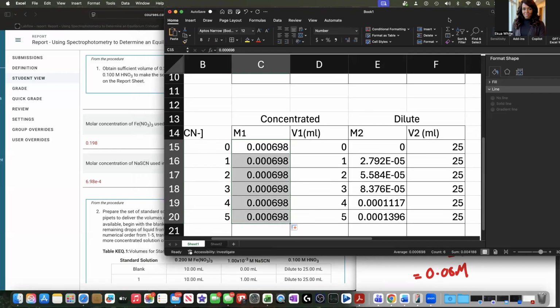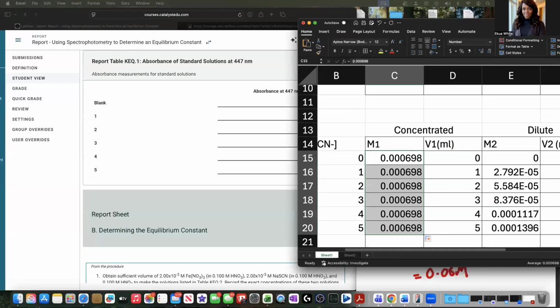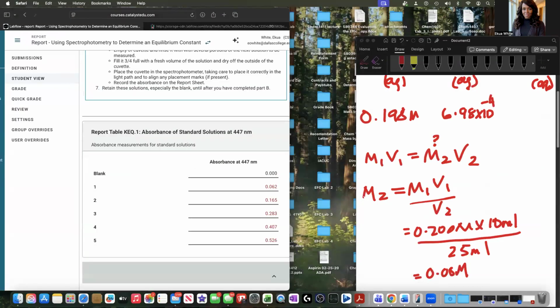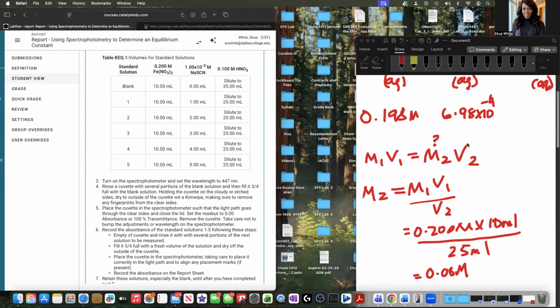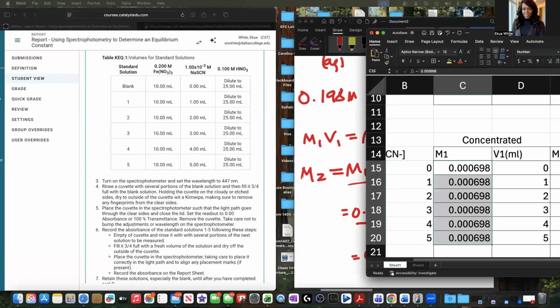So let's go ahead and verify that. In the first run, I have so many documents here. I'm trying to make this as short as I can. Let me minimize this page a little bit. I feel like I need a wider computer. I have 2 screens here, but right now this is not very helpful.